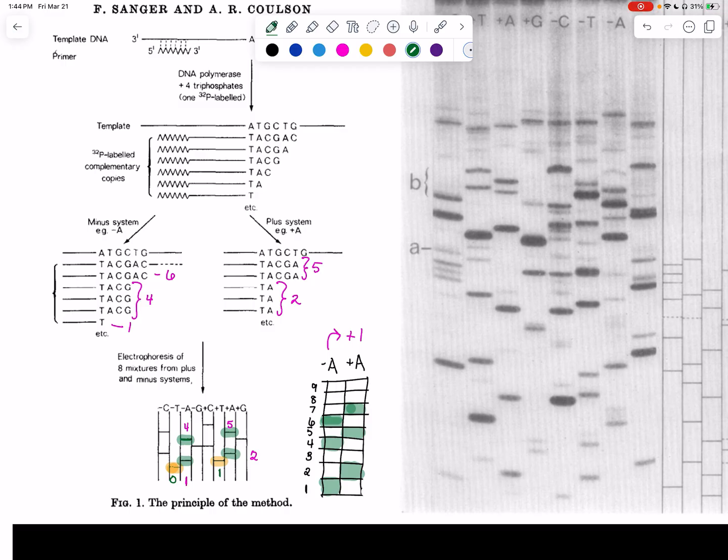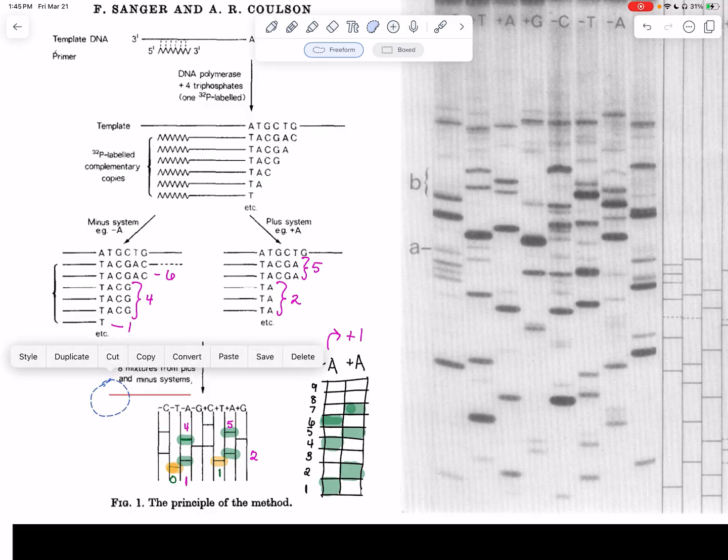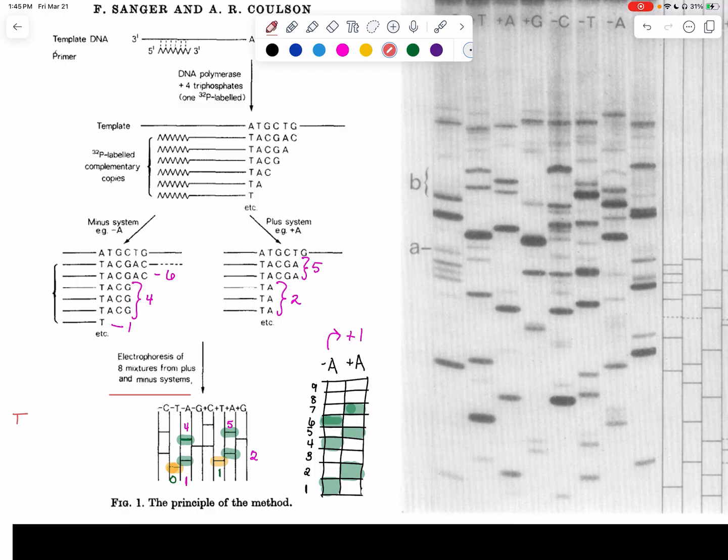And so how these scientists interpret these results is they will utilize a horizontal line, and go through to see where we are hitting a nucleotide. If we look at the minus side first, we move our line up along. We first hit a T, then an A, a C, a G, an A, another C. That continues in that pattern. So if we record the bands we see, we would start with a T, then an A, a C, a G, an A, and a C.